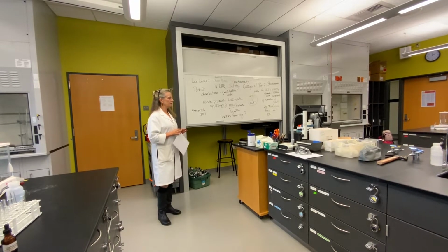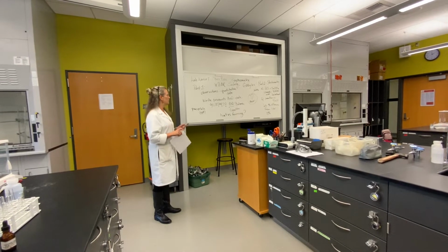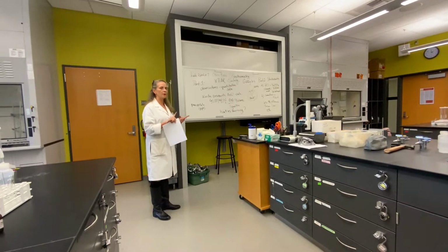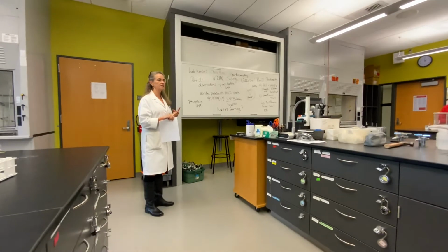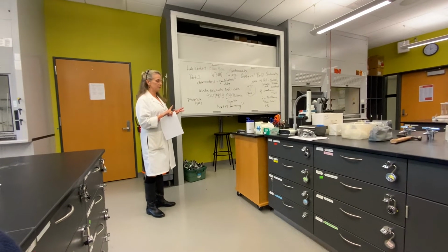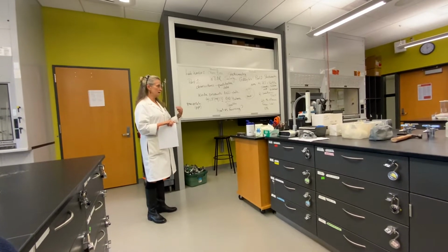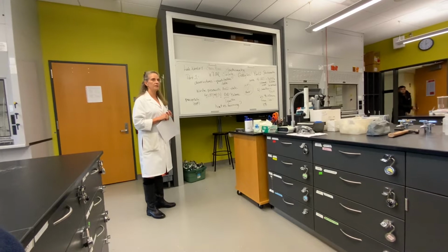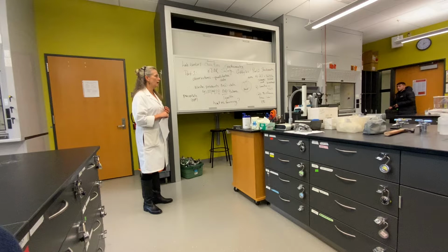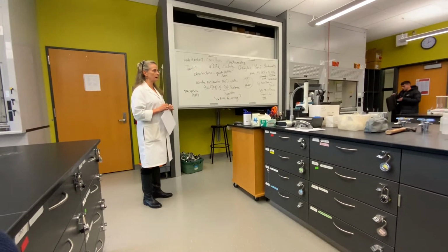But I really want you guys to go into the 4 indications of chemical reactions, right? So I want you to see a precipitate, which you have already seen, but they were boring. I want you to see the evolution of heat and light. So you'll get both of those today, and I'll tell you where to be careful about that. You're gonna see a dramatic unexpected color change, okay? And you're gonna see the evolution of a gas. And we're actually gonna light that gas in here, okay? So those are the 4 fundamental things that you will be looking for when chemistry happens, okay?